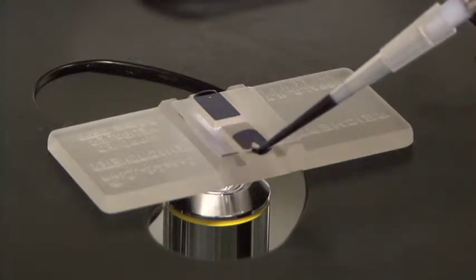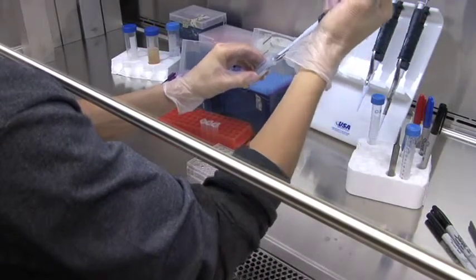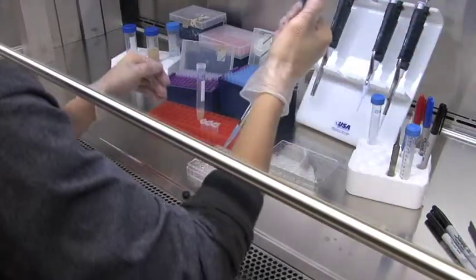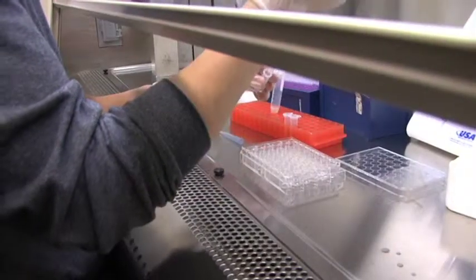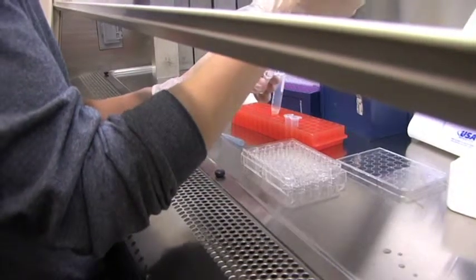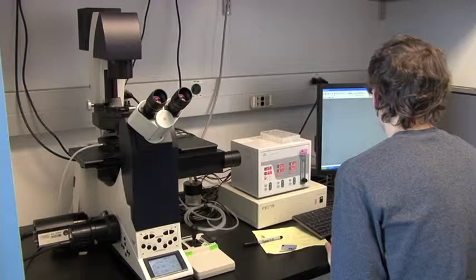At this point, the cells have proliferated enough to use for the experiment. 10,000 cells are then plated onto each well of the native substrate-coated plate. The stimulus factors, contained in the crushed muscle extract, are then added to the cells in each well. These factors are believed to make the cells move.